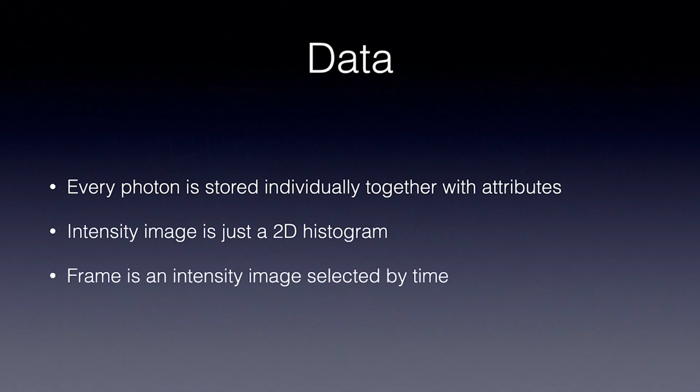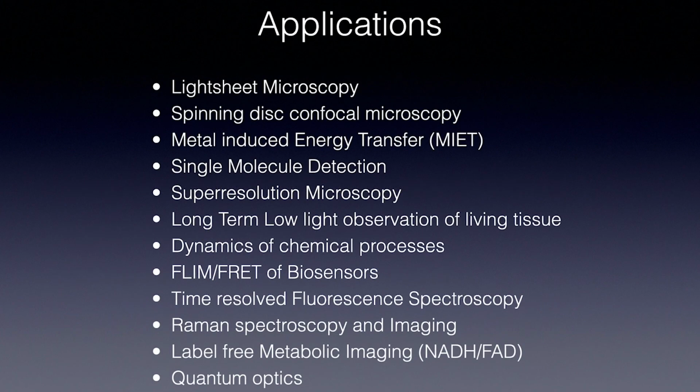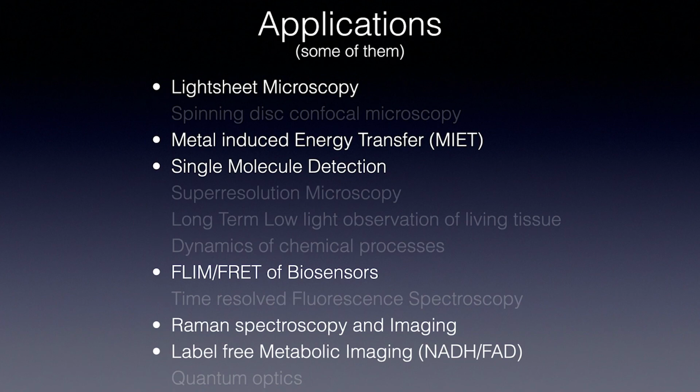To conclude, yes, this is a camera without any pixels. We store the attributes of single photons in lists. We use computers to access the data. Thus, we have full freedom in defining pixels or frames in the software. How can we use it? Let's take a look at the applications. Well, some of them.